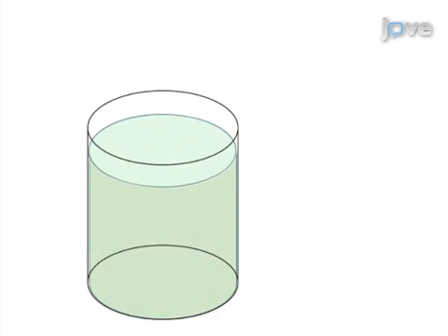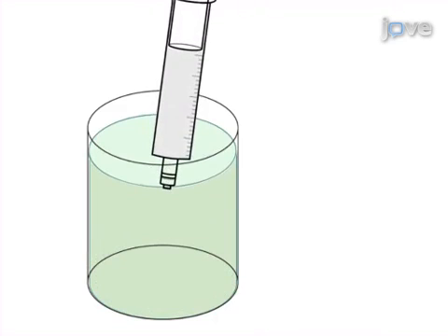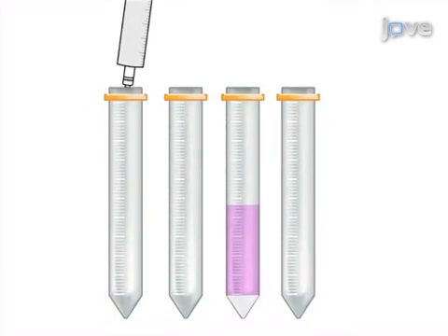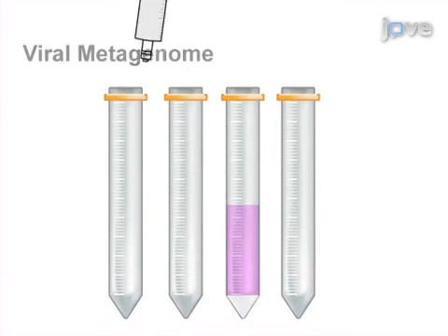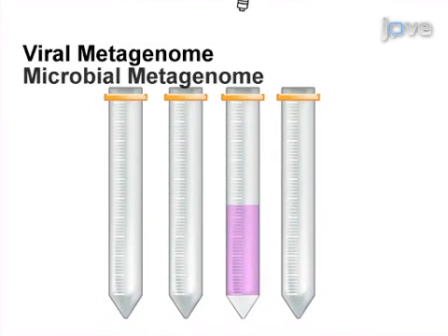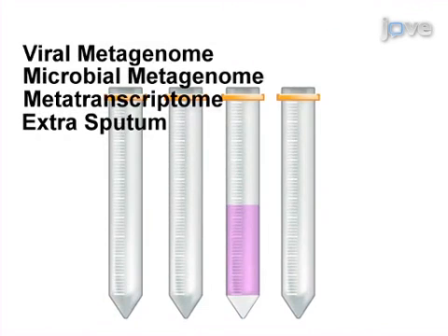Next, the sample is immediately homogenized and equally distributed into four tubes labeled as viral metagenome, microbial metagenome, metatranscriptome, and extra sputum.